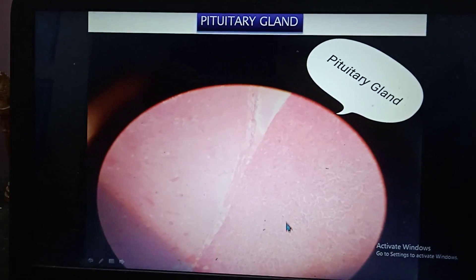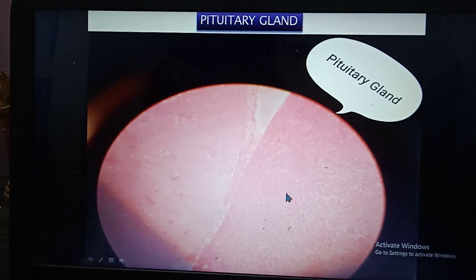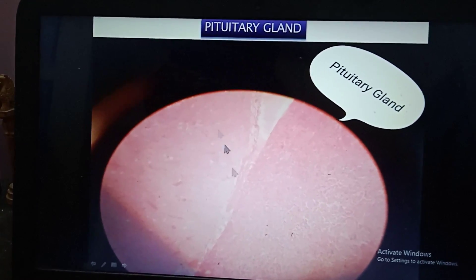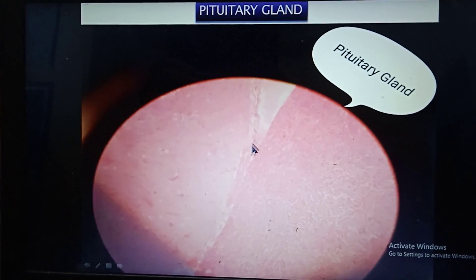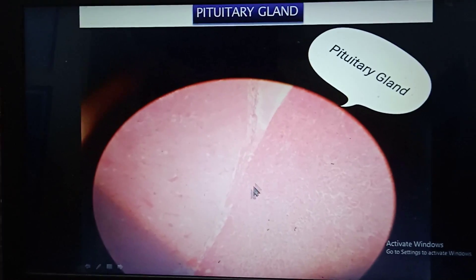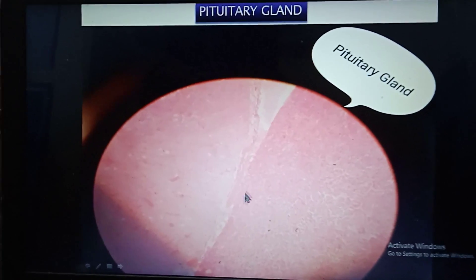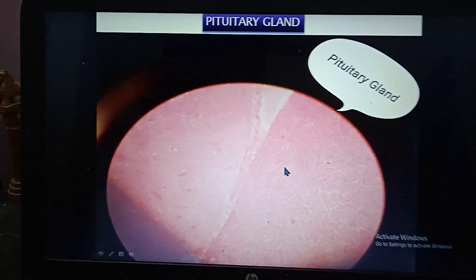This is the pituitary gland. It is darkly stained due to chromophils and lightly stained cells are chromophobes. In the midline there is the pars intermedia — a median cleft.